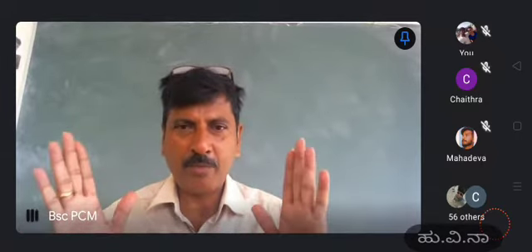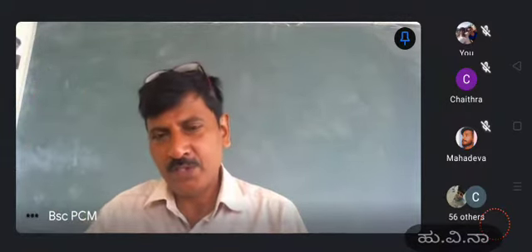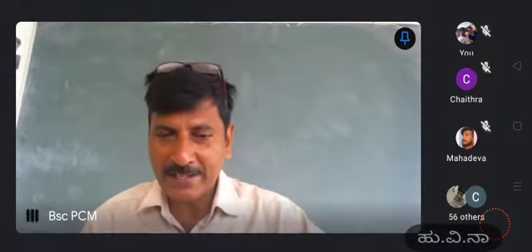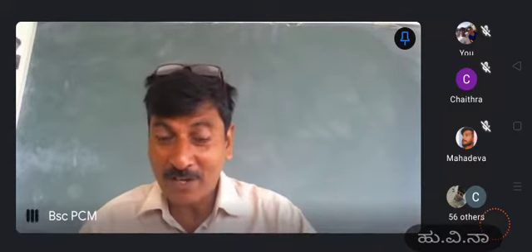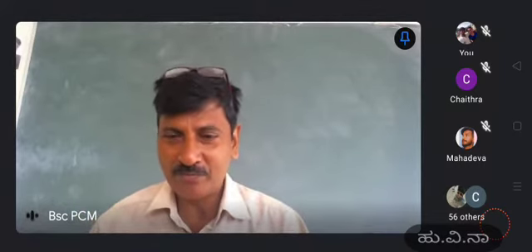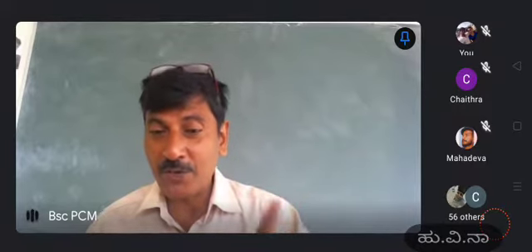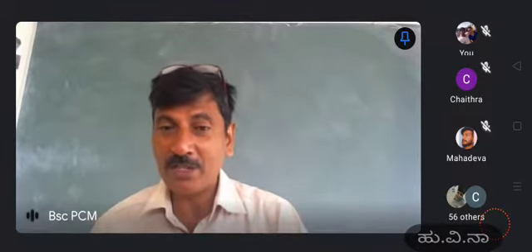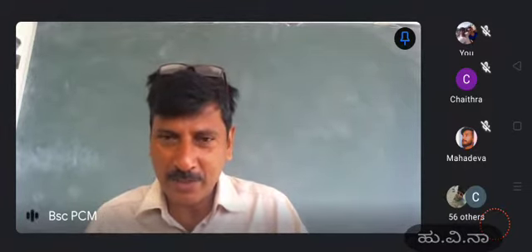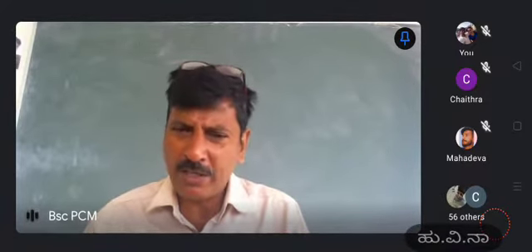I am talking about NMR. N stands for nuclear magnetic resonance. This is totally the interaction between the nucleus and electromagnetic radiation. Not all electromagnetic regions are capable of giving NMR. Only the radio frequency waves, only radio waves, are capable of giving NMR, because the energy of that particular wave is very low.